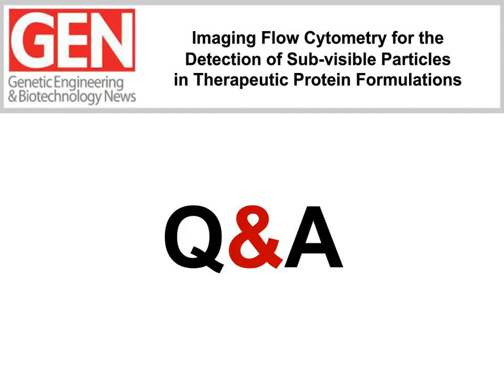And they are beads that do not have the same physical properties as a protein particle. And as you could see on some of the slides I showed, with the TEM and the MFI digital imaging data, the protein particles tend to be translucent and amorphous and have a different morphology. And because of that, it can be a challenge to measure the size and number of those particles because it is difficult to compare them to the standards used to calibrate the equipment.